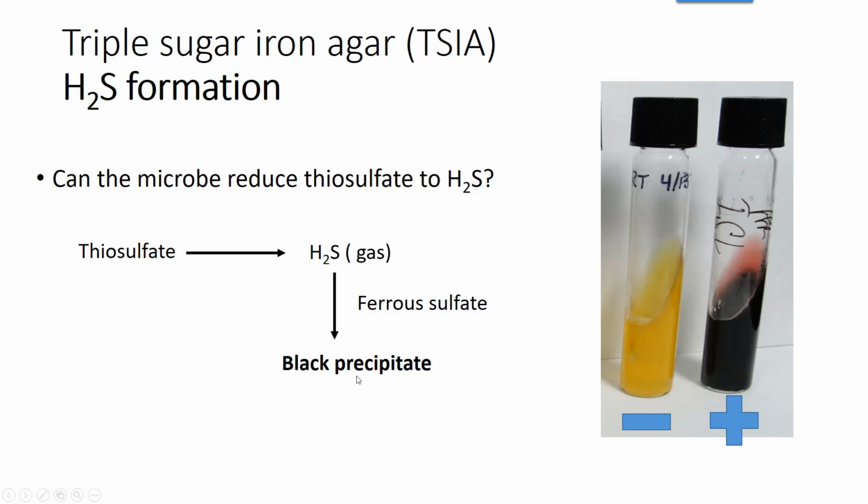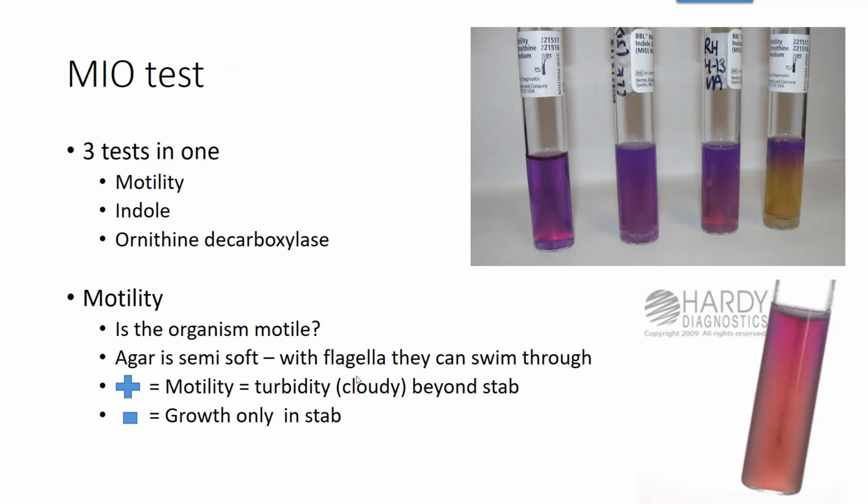So now we're going to go on to the MIO tube. This is on the other worksheet. We'll come back to bile esculin and sodium chloride broth later because they're for gram-positive bacteria. But the MIO tube tests for 3 things, so it gets 3 rows on the worksheet. Now, the first thing that it tests, I filled it in for you.